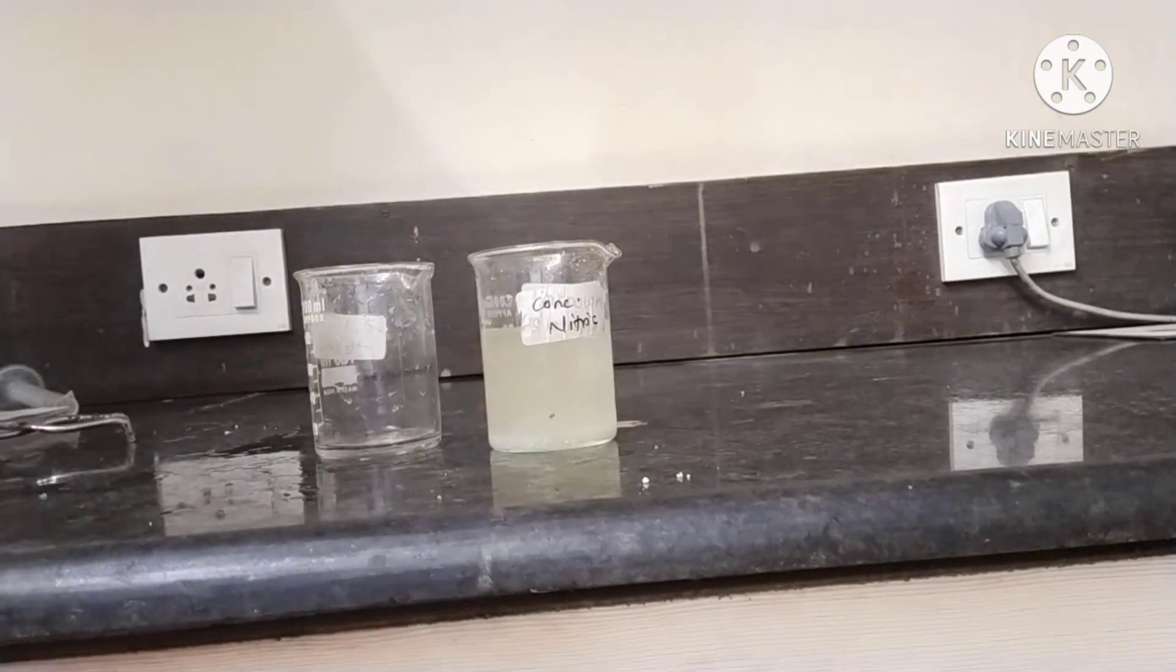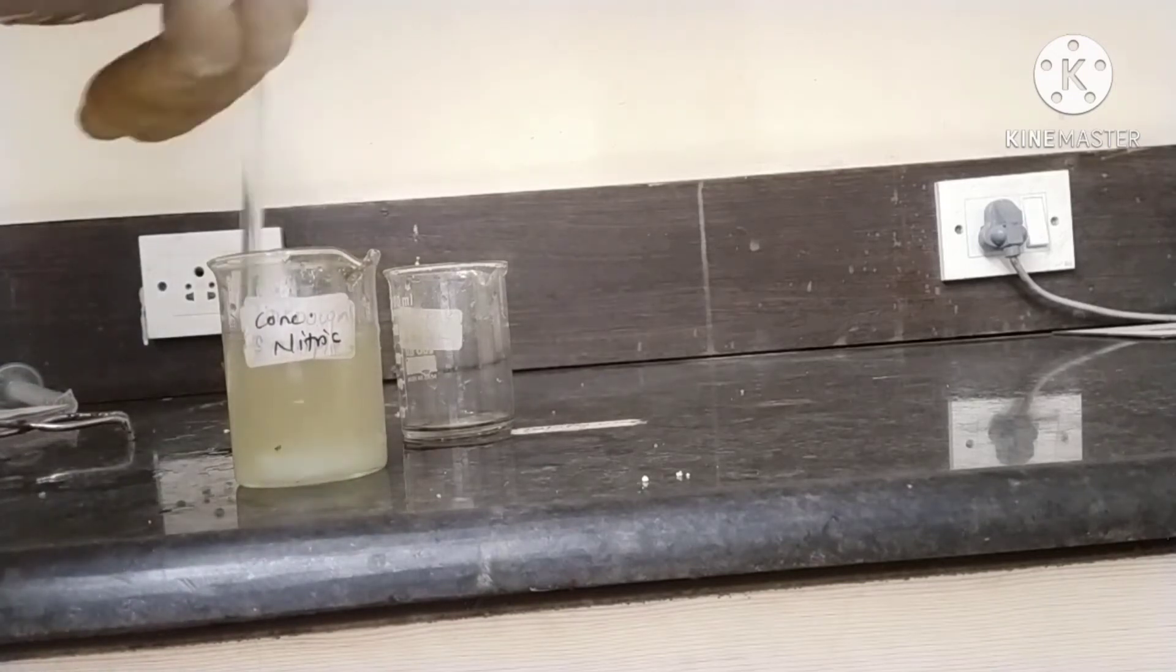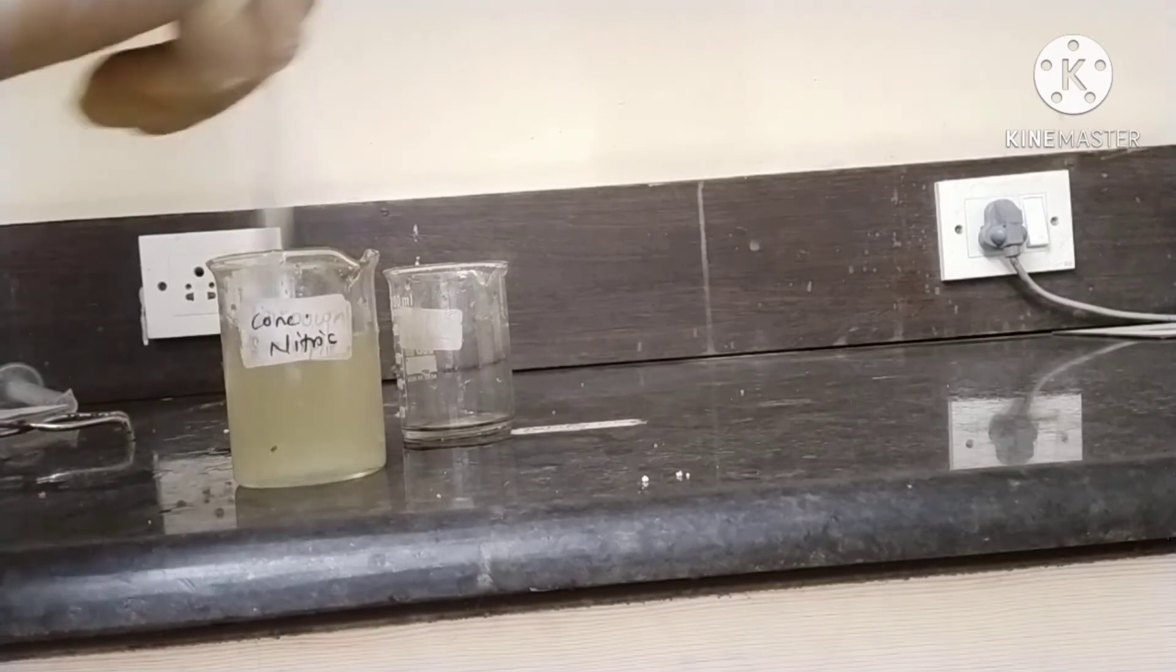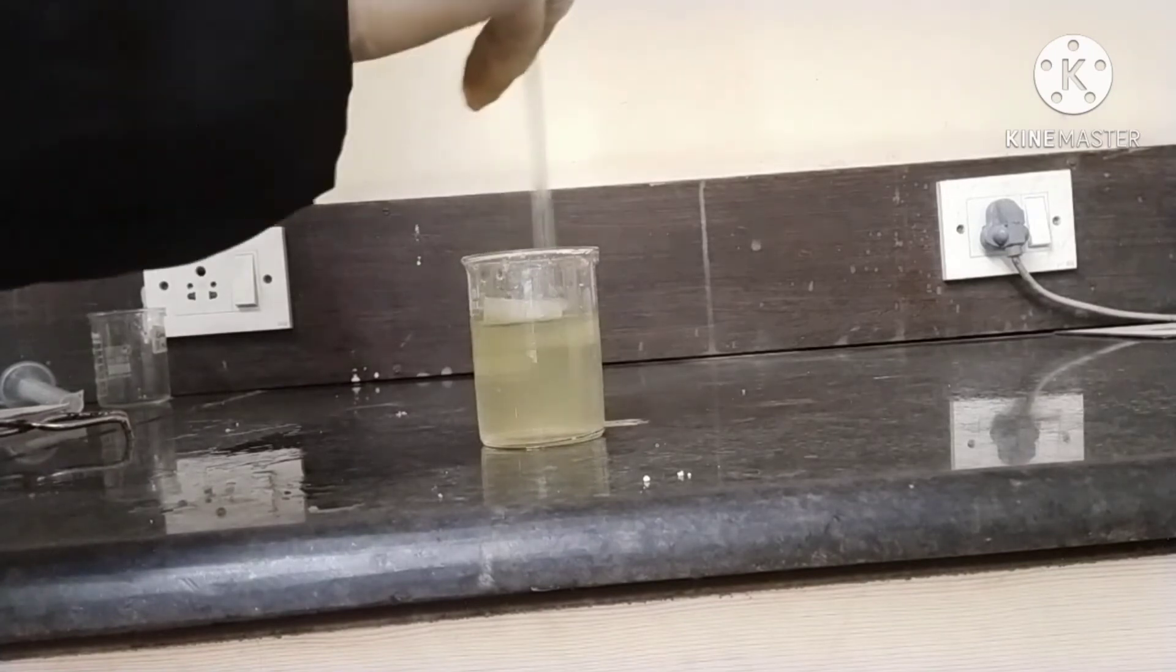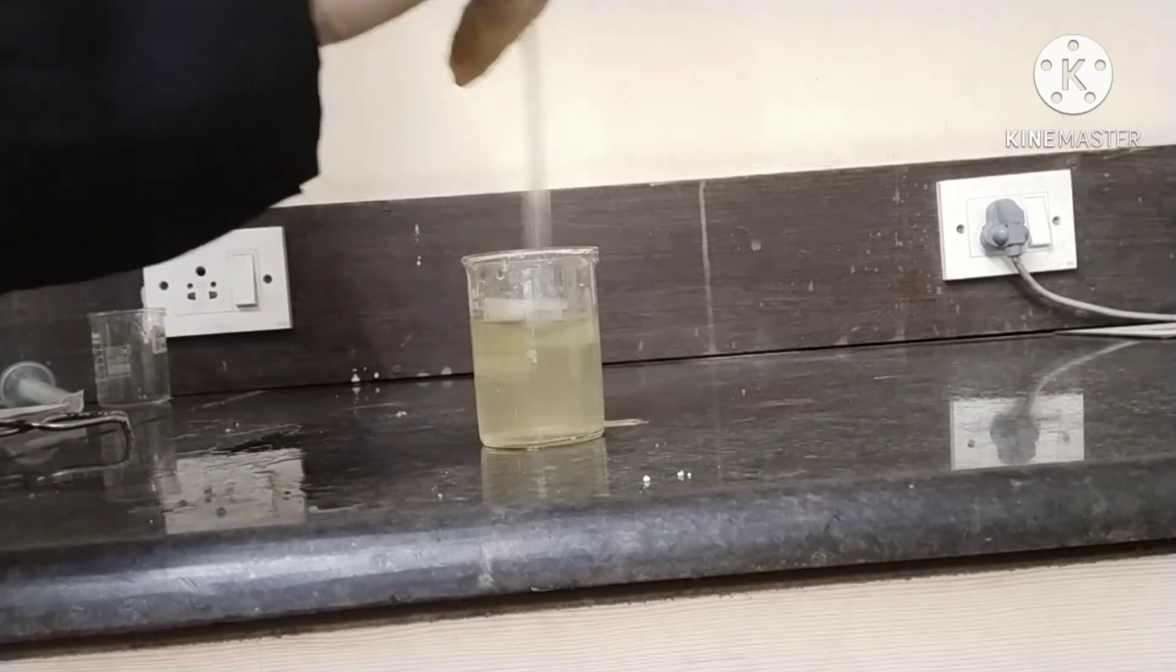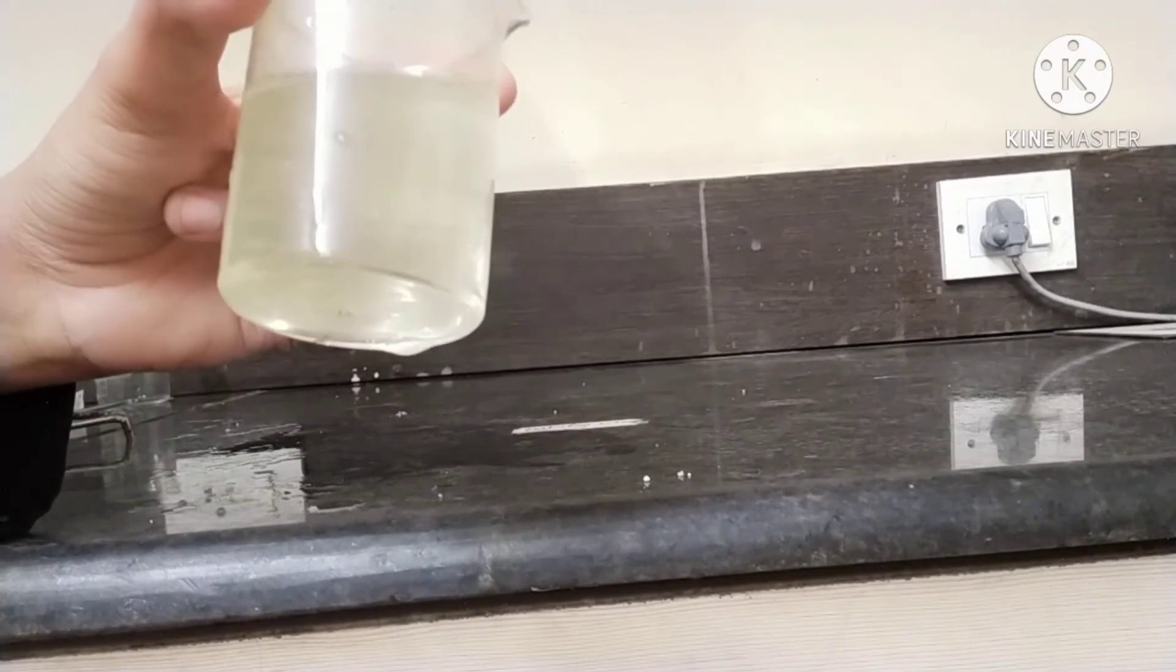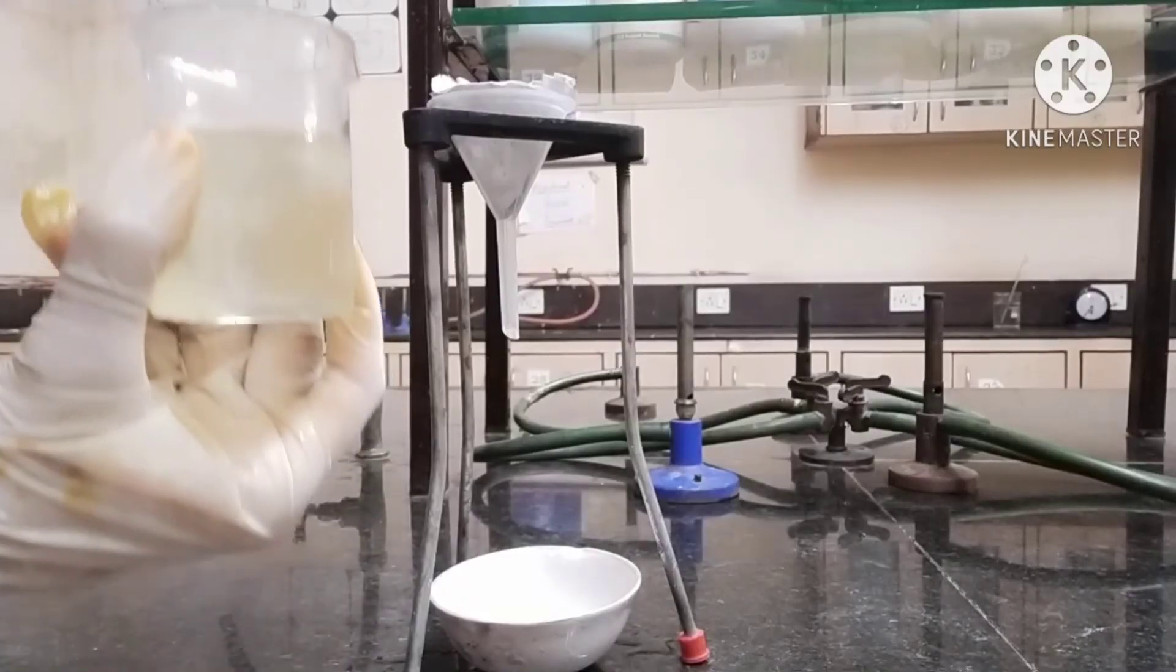Stir it. Stir the solution with the help of a glass rod. Stir it until the salts have completely dissolved. After adding boiled water, stir the solution constantly until the salts are completely dissolved. Now you can see clearly the salt particles are completely dissolved.